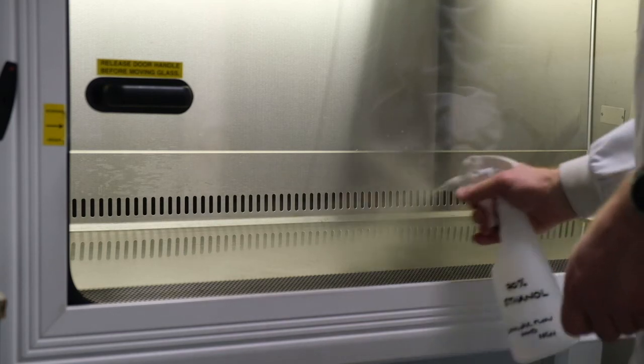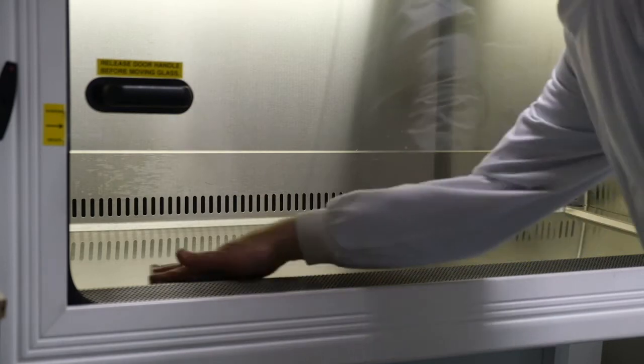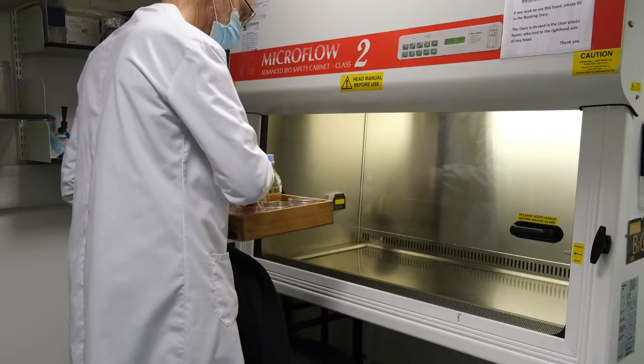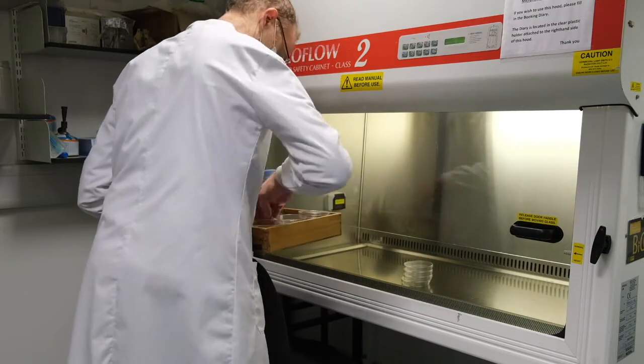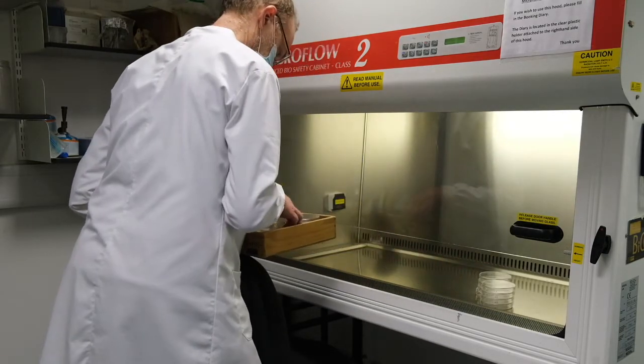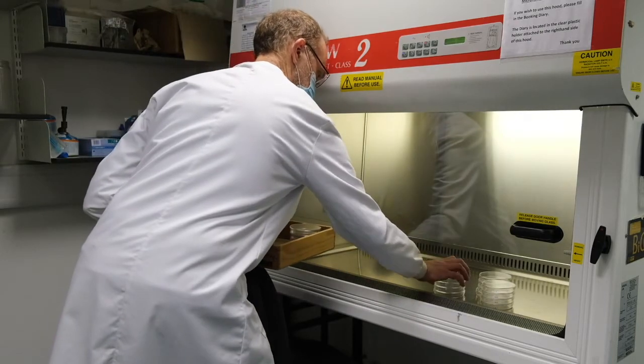Before use, we ensure that the hood is sterile by wiping down with 70% ethanol. We can now place our labelled petri dishes and our molten agar in the flow hood, ready to pour our plates.